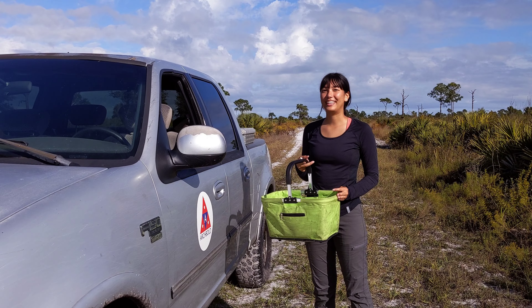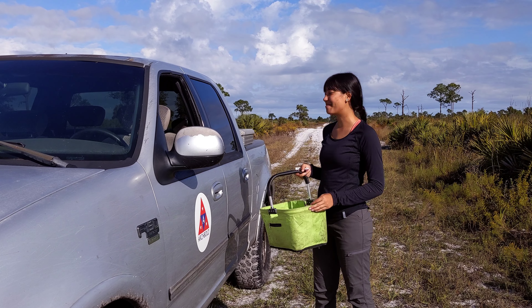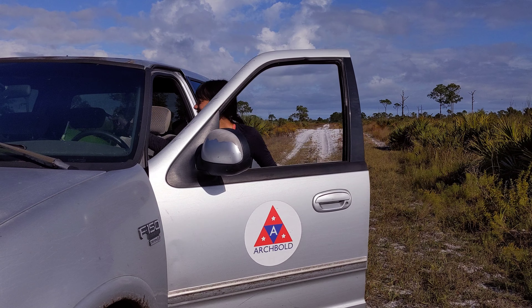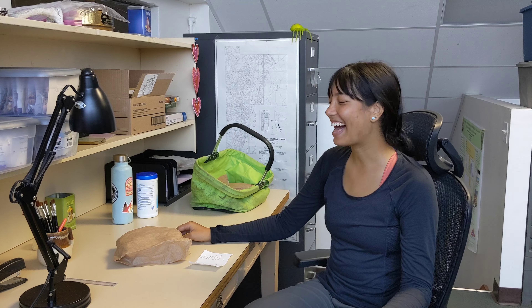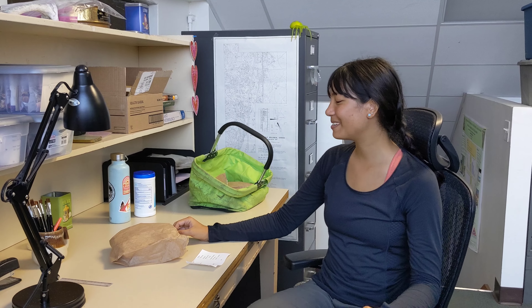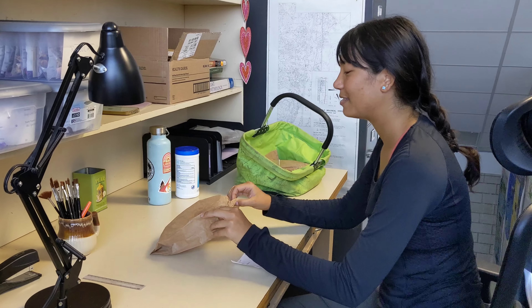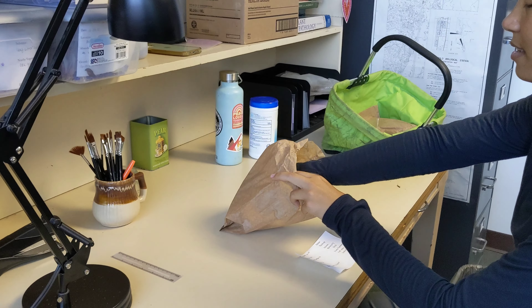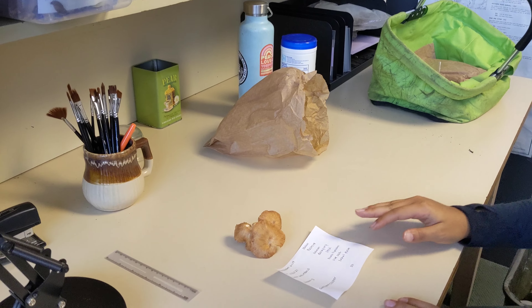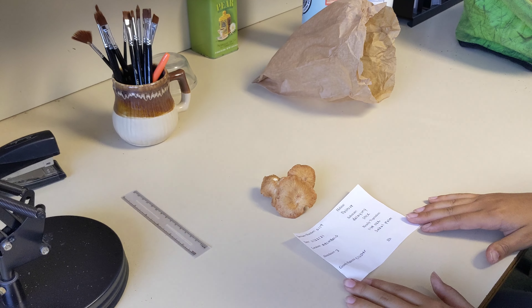Now that we've collected our specimen and taken its data, let's head back to the lab. Welcome to the lab. So now I'll show you what we do with the specimens once we get back from the field. This is the mushroom we collected earlier, and this is its data card.